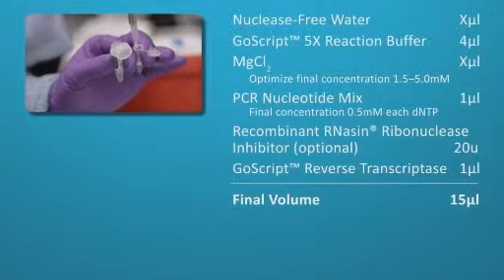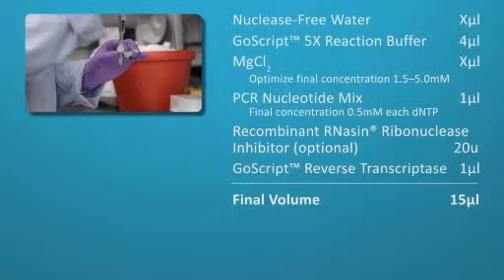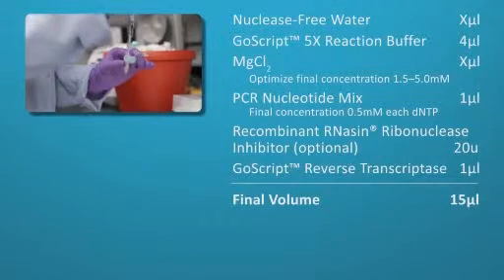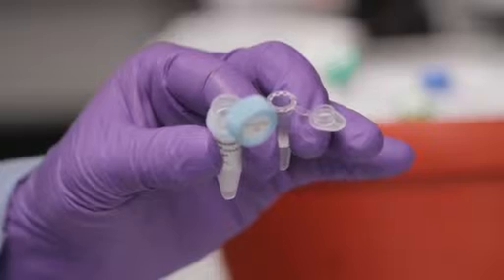Optionally, add 20 units of recombinant RNasin Ribonuclease Inhibitor, then 1 microliter of GoScript Reverse Transcriptase. The volume of nuclease-free water added will depend on other volumes, but should result in a final volume of 15 microliters per reaction.